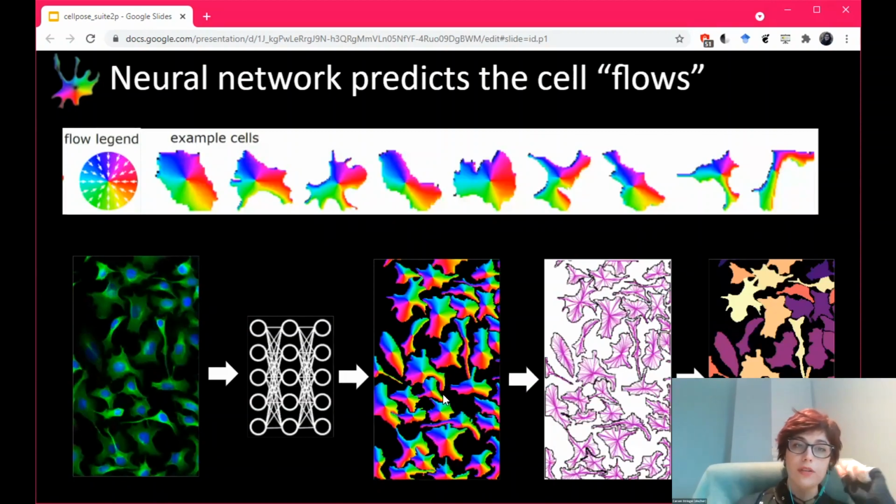Yeah. No, we don't. But that's a really good point. We don't allow overlaps. And so like StarDist, we basically have to assign every pixel to one cell only. So we don't have multiple maps. So that is one advantage that Mask R-CNN has, for instance. It proposes these regions, and these regions can be overlapping, and then it goes back in and defines the mask within that region. So Cellpose and StarDist don't have the ability to learn these overlaps. But in theory, it would require more maps at different levels, for instance.